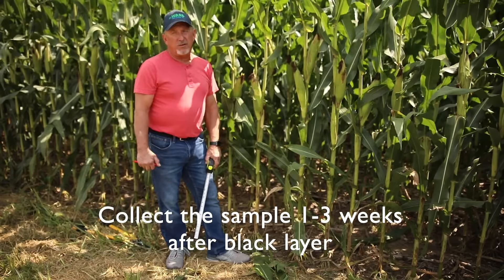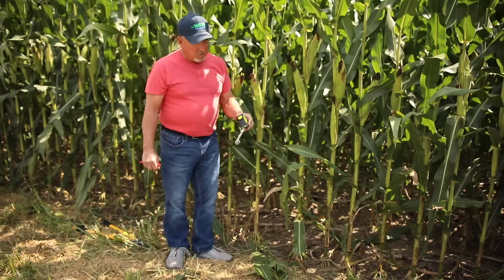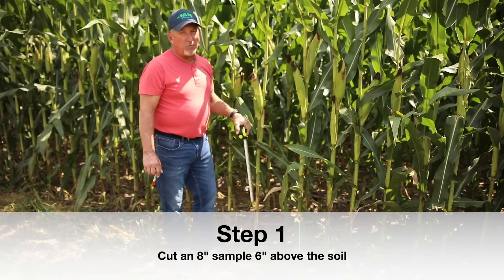You always want to collect it after black layer. I've got my little tape measure — we want to collect an 8-inch sample, but we want to collect it from 6 inches up to 14 inches.